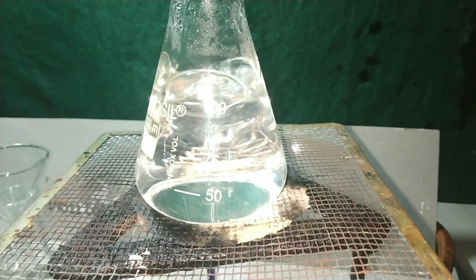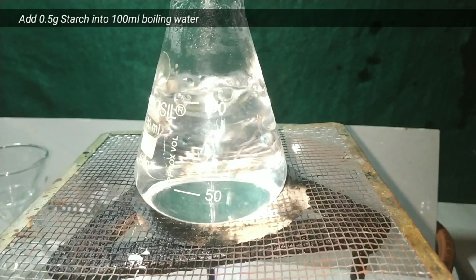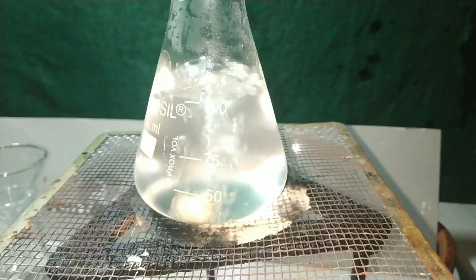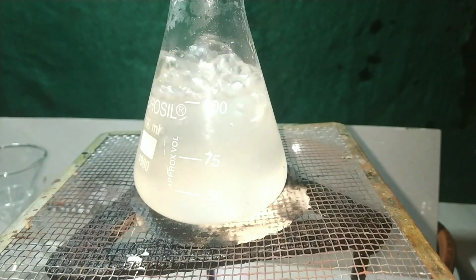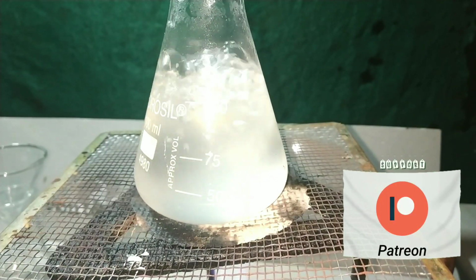Now let us prepare starch sol, which is a lyophilic colloid. This is actually a very easy preparation. Just boil 100 milliliters of distilled water and add 0.5 grams of solid starch into it. Continue boiling the solution until all the starch particles get dispersed and the solution becomes opalescent. And finally we have the starch sol.